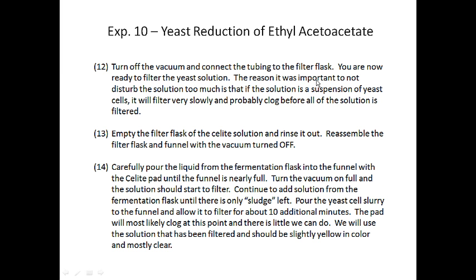And the reason that you want to keep the yeast as a thin layer on the bottom of the fermentation flask is that if you have a suspension of yeast, it's going to filter very slowly and it'll probably clog, and then you'll have to prepare two or three of these Celite pads, and you only want to create one. So it's important you keep the solution as undisturbed as possible.